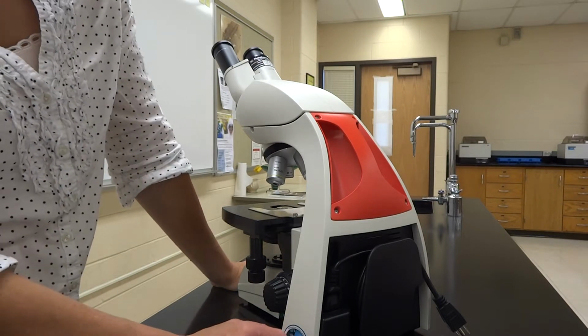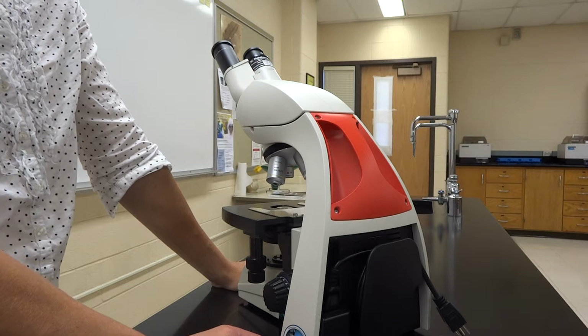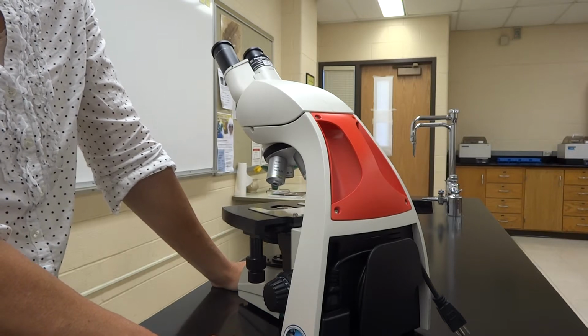So we are going to run through how you're going to use the whole scope from start to finish, because I'm going to give you a little hint right now. This is a question on your lab exam. I'm not even going to hide it from you. Hey, you will have to focus the microscope, so learn it now. Don't rely on your poor lab mates.